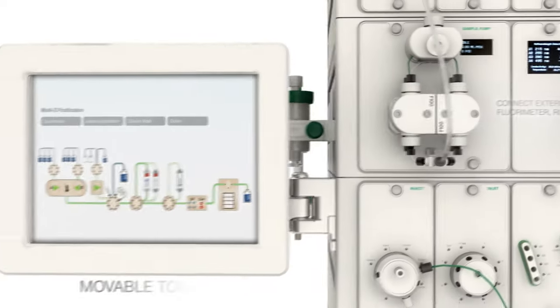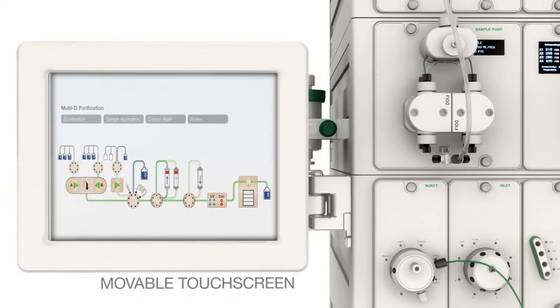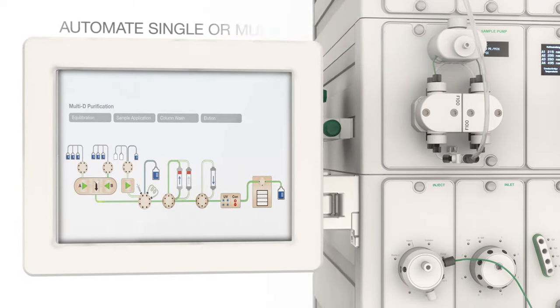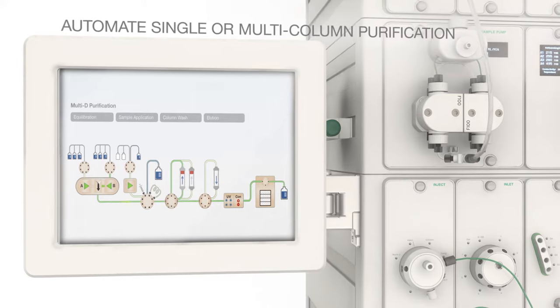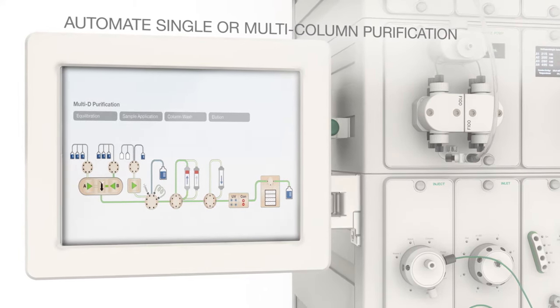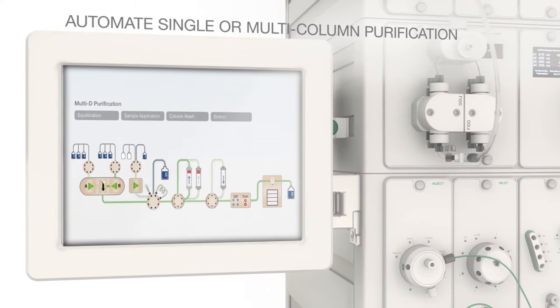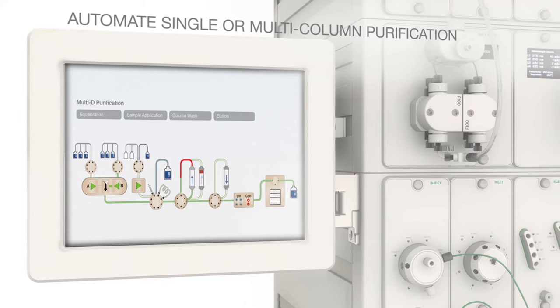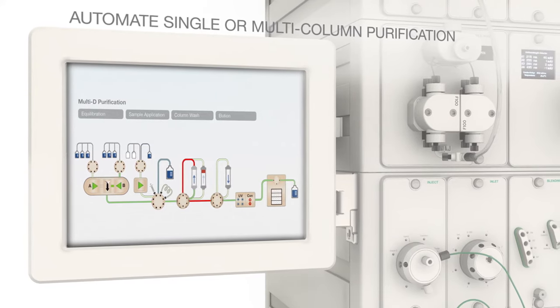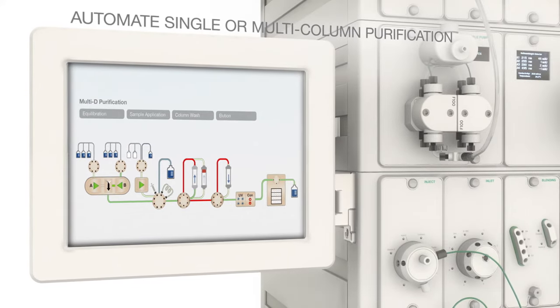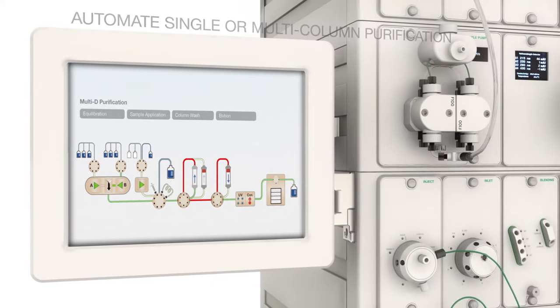An onboard touch screen provides manual control. With the NGC system, automate single or multi-column purifications for increased reproducibility and minimized sample loss. For example, capture your monoclonal antibodies on an affinity column followed by a desalting column.